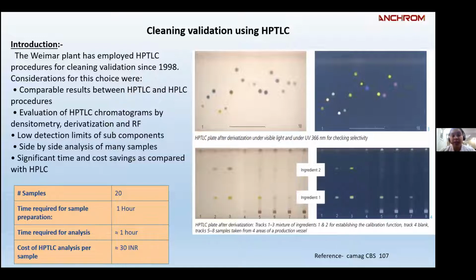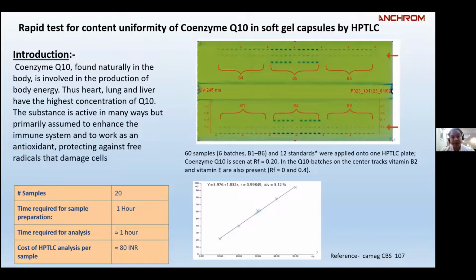For that, you can mostly use HPTLC because at a time 15 to 20 samples you can check, and it will save you time and cost as compared to other instrumentation. So cleaning validation is one of the most advantageous applications of HPTLC.